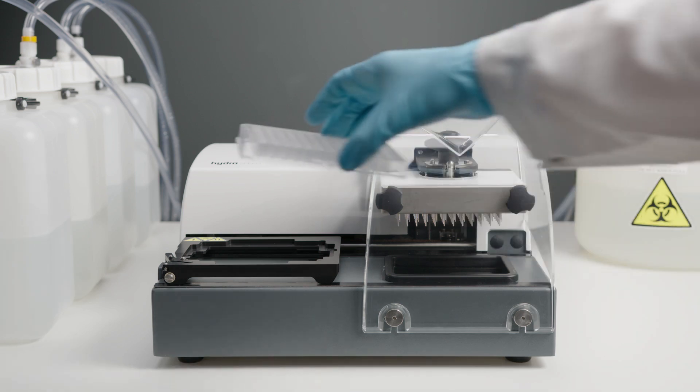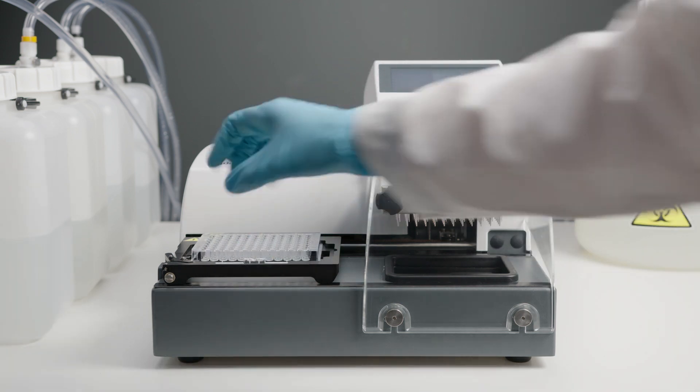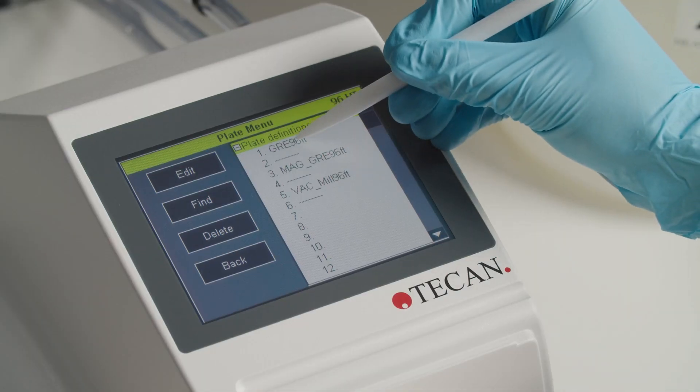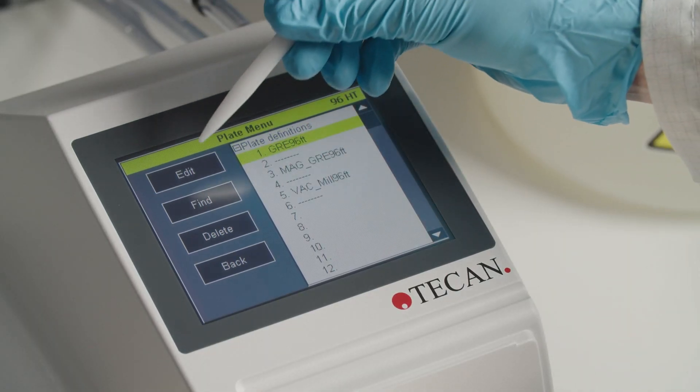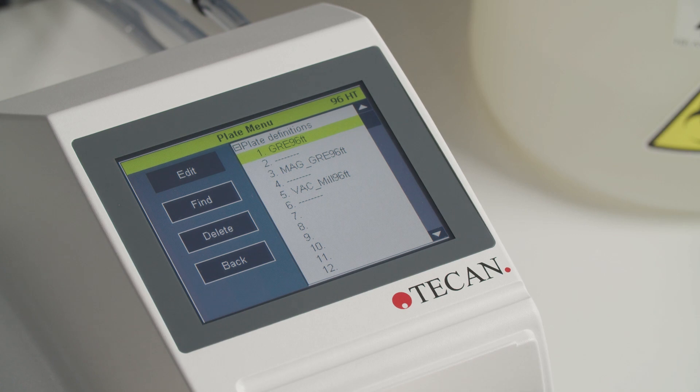Place the corresponding plate on the plate carrier before starting the process. Choose a plate definition identical to the well format of your plate and press edit to change the plate parameters.